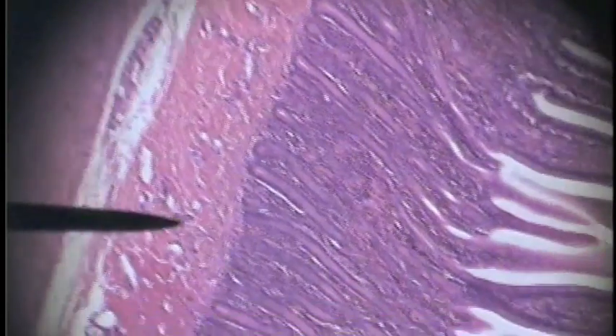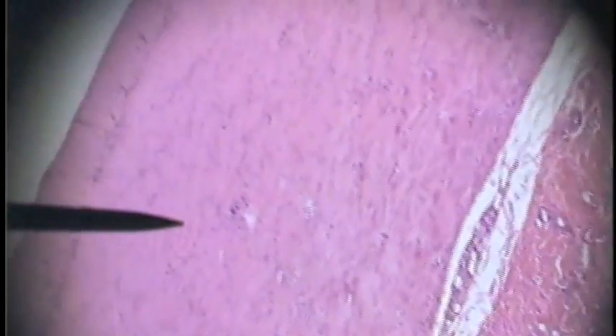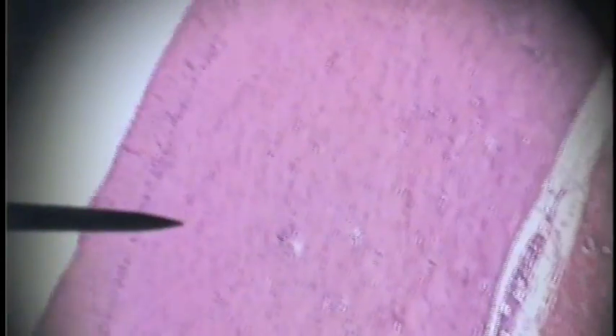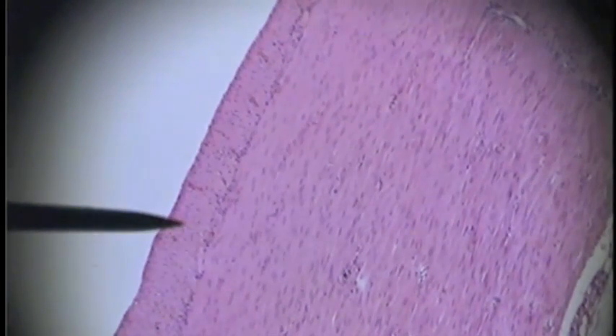Here is the submucosa — this pinker tissue. Now we're into the tunica muscularis. We have two layers: the tunica circularis and the longitudinal layer. Here is the circularis and here is the longitudinal layer. Indicated here is the tunica cirrosa.